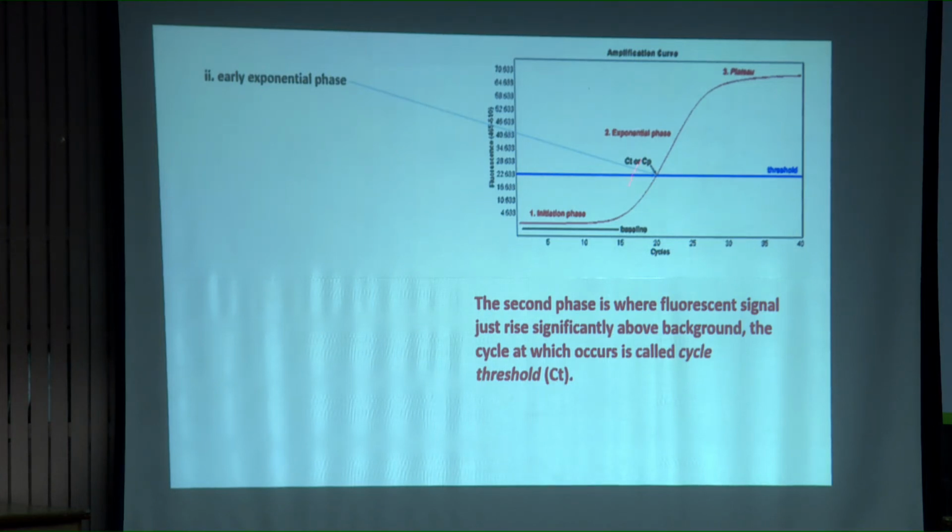You know what is the name for this? This is called CT values or CQ values. Right? In real-time PCR machines, the data we generate from the machine is CQ values only. And remember, this is captured at early exponential phase.